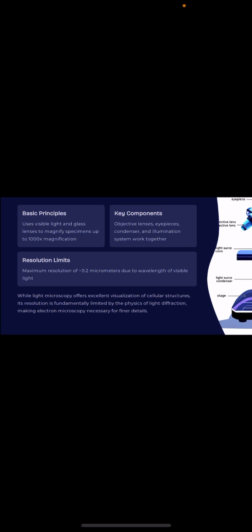The reason why people also prefer using an electron microscope is that a light microscope does not assist in viewing every kind of cell. Sometimes scientists or researchers need to view even the tiniest cell, which they find through their research. So it's not possible to view it under a light microscope. In order to view those very small things, like viruses or the structure of plant cells, they use an electron microscope, because it uses a beam of electrons for much higher magnification.